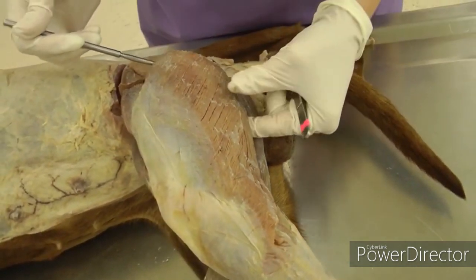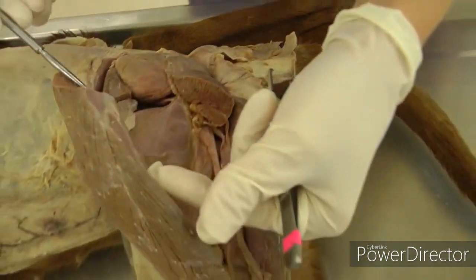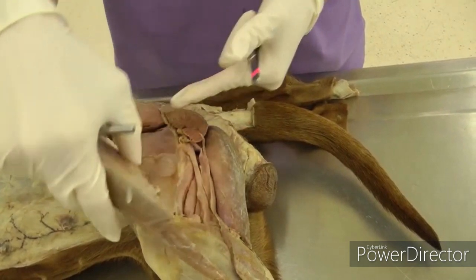Reflect the biceps femoris by making a cut right across near the origin, then reflect the main muscle mass distally down. But do not cut the fascia lata — you don't want to cut that part, as this is what's going to keep it attached to your limb.